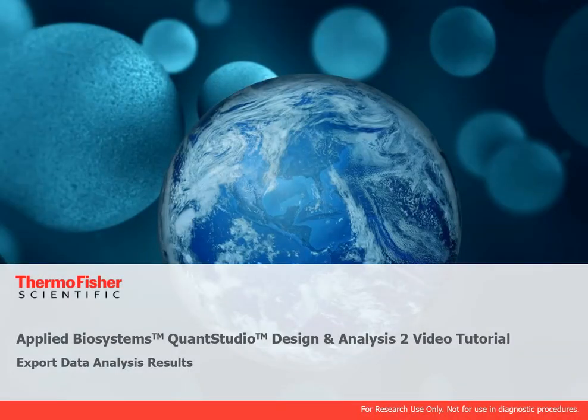Welcome to the video tutorial series for QuantStudio Design and Analysis 2. For this tutorial, we will be using the desktop version of the software, but you can also use the application on the Connect platform. In this video, we'll show you how to export data analysis results.